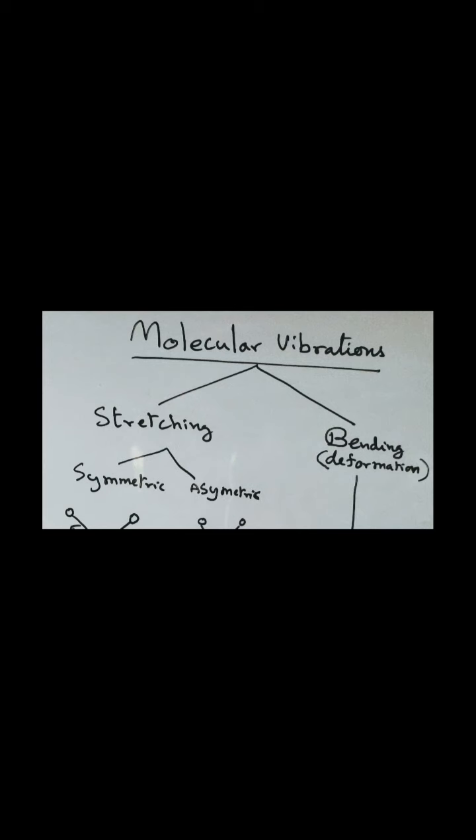The chemical bonds, which are made out of two electrons, are just like a spring-like structure. Actually, the spring-like structure is in a constant state of vibration. Because of these vibrations, called molecular vibrations, which occur at a particular frequency, the chemical bond is able to absorb electromagnetic radiation if it matches with the wavelength or frequency of the electromagnetic radiation.